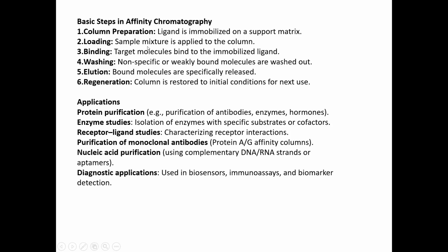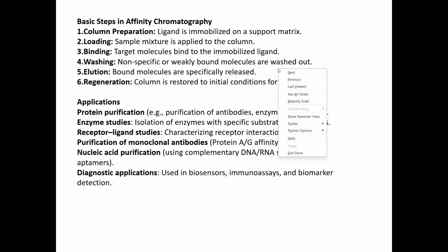So your sample mixture is applied to the column, then binding takes place, the target molecules bind to the immobilized ligand, and then you do your washing so that the non-specific and weakly bound molecules are washed out.